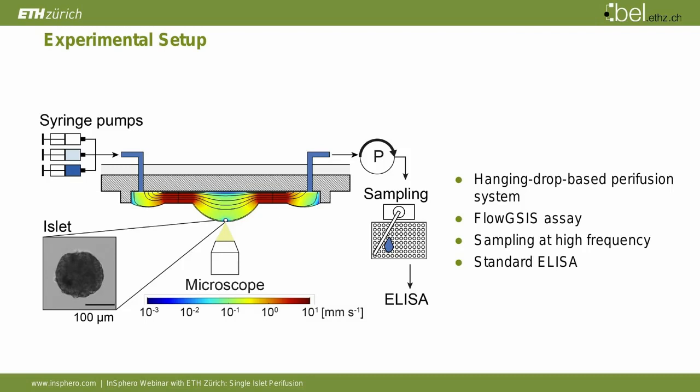We also have a microscope to track the position of the islet microtissue, and we then implemented a feedback algorithm that fine adjusts the syringe inflow rates to make sure that we can maintain the drop shape and volume.